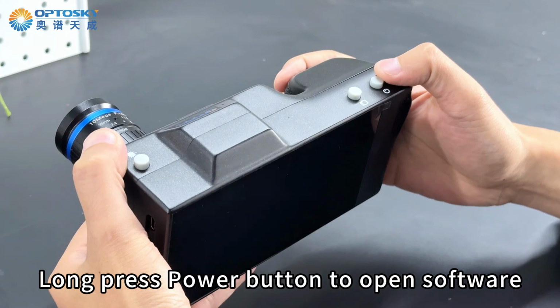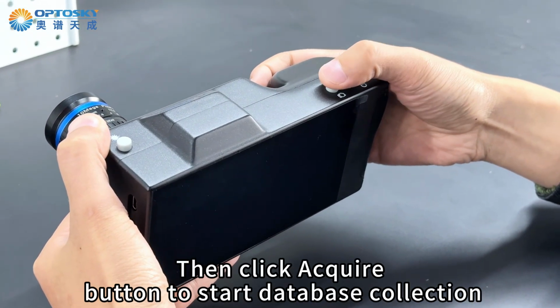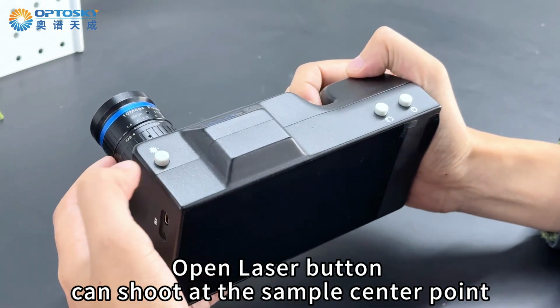Long press the power button to open the software. Then click the acquire button to start database collection. The open laser button can shoot at the sample center point.